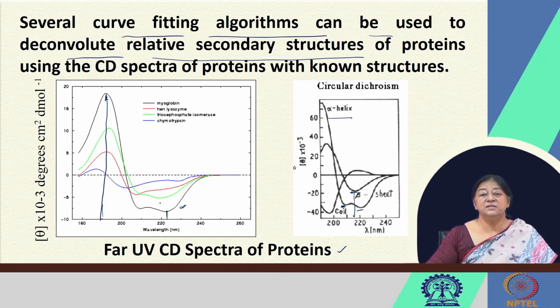When we look at vibrational spectroscopy, we are looking for specific characteristics in terms of the stretching and the bending modes of the bonds. And when we look at secondary structural elements, we are looking at the C double bond O and the NH.